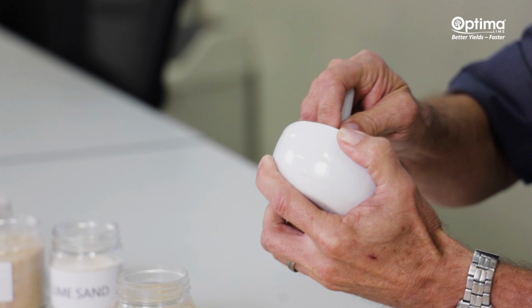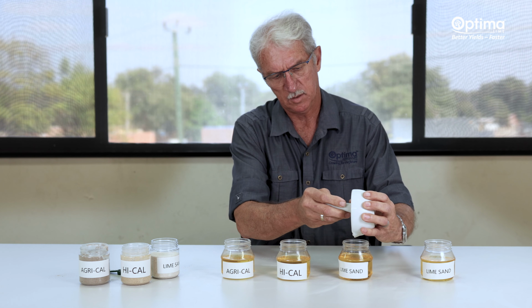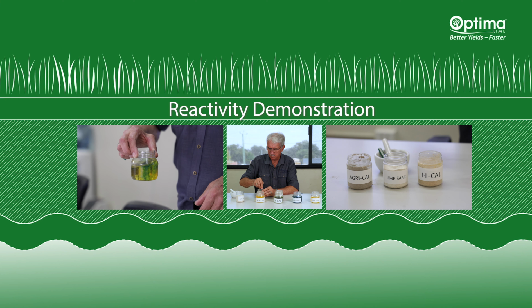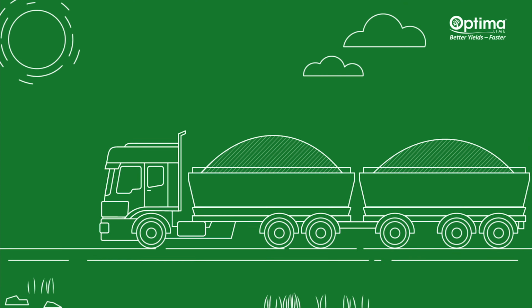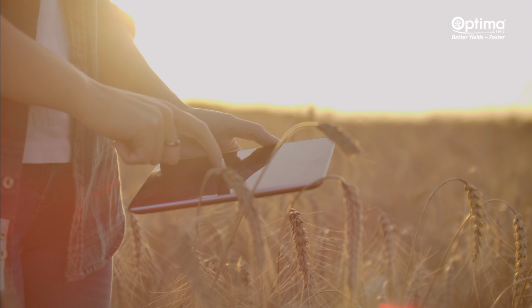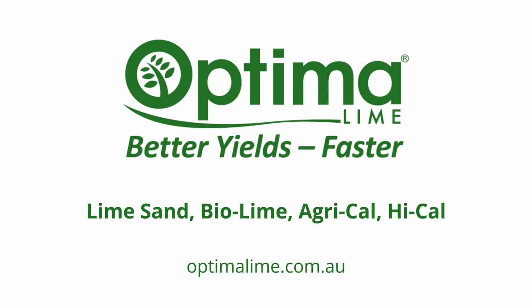In this video, soil scientist Burt Naude presents a reactivity test developed by Optima Lime. This test shows how the physical and chemical properties of liming options can significantly influence the effectiveness of soil pH remediation. Selecting the appropriate lime application solution not only enhances performance, but can also save time and money.